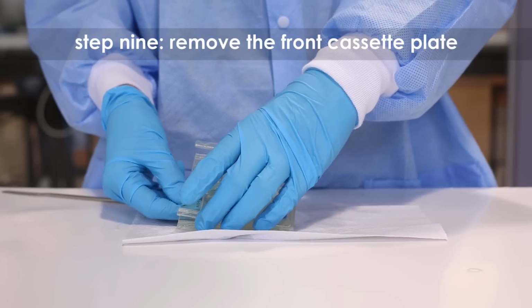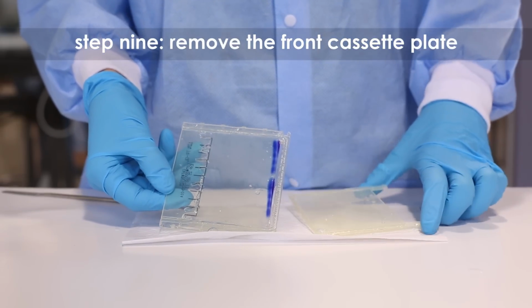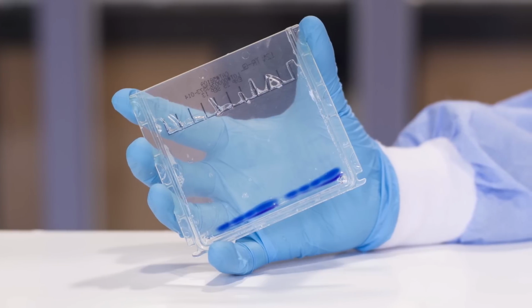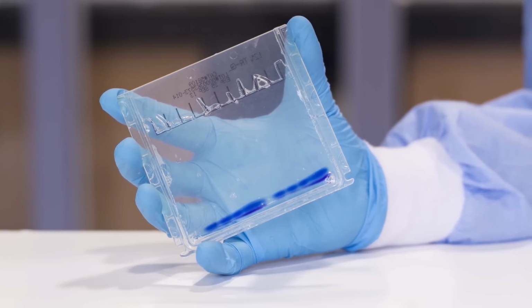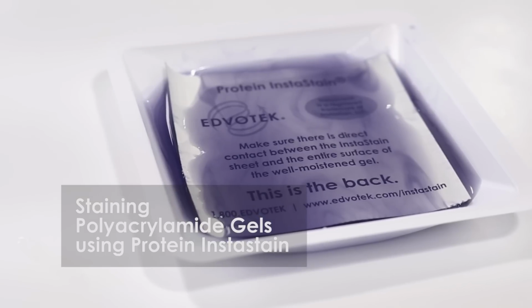Step 9. Gently lift the front plate away from the larger back plate. In most cases, the gel will stay on the back plate. If the gel partially sticks to the front plate, let it fall onto the back plate. Step 10. Proceed to staining the gel or to Western blot.